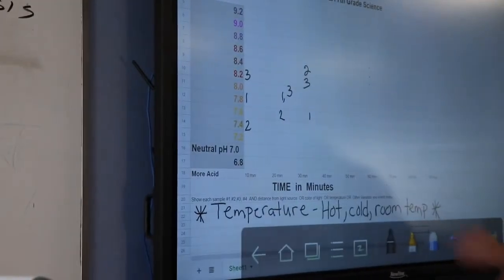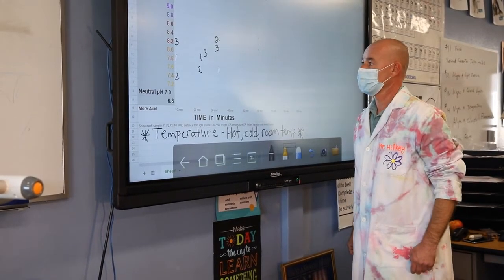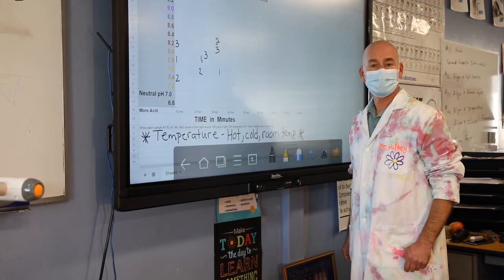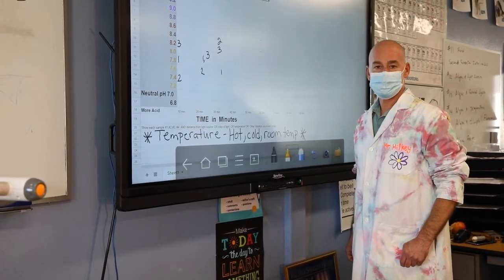Perfect. So let's go ahead and take a look at our graph. Excellent job, Mr. David. Thank you. And we'll come back at 40 minutes. Well, actually, we'll let it sit for another 10 minutes and record that. And we'll also record 50 minutes, and then we'll draw our graph.